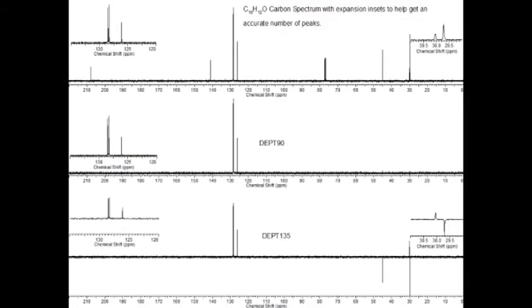Since you can't process these spectra yourselves, I've included a couple of expansions on the carbon spectra. At regular magnification, it might not be obvious that there are actually 2 very closely spaced peaks above 125 ppm and again around 30 ppm. One of the skills I emphasize when people are analyzing spectra, especially on their own computers, is to look at the peaks closely, zoomed in so that they fill the screen. It is not uncommon, especially in carbon spectra, that what appears to be one peak in the normal presentation of a spectrum on paper or on screen is actually two or more when looked at closely.